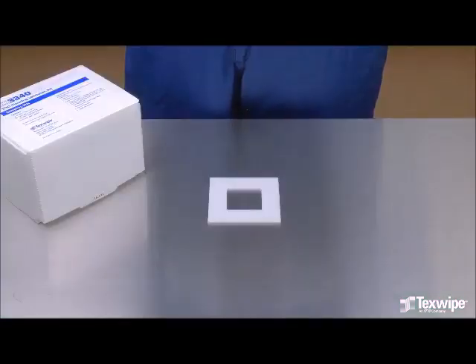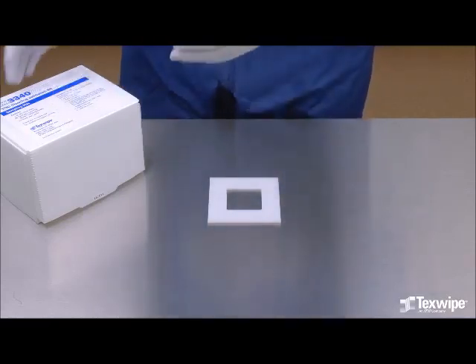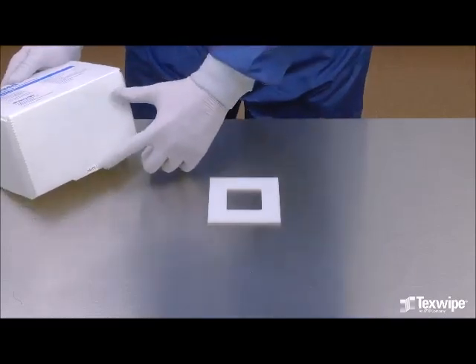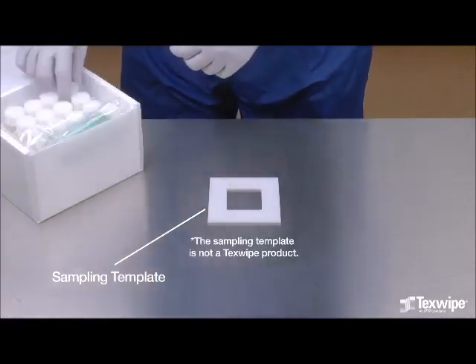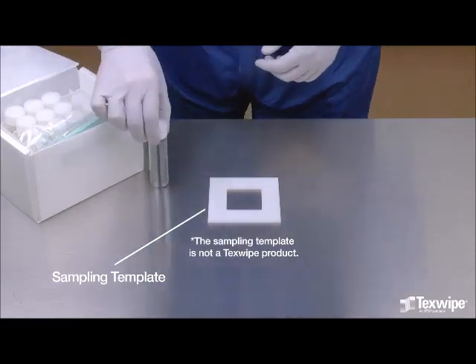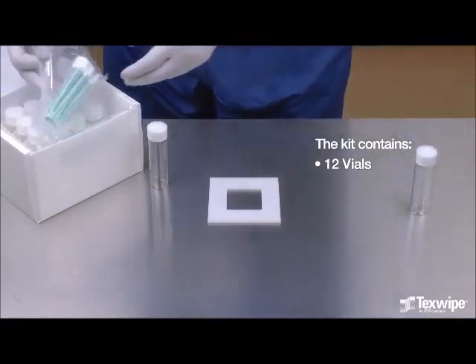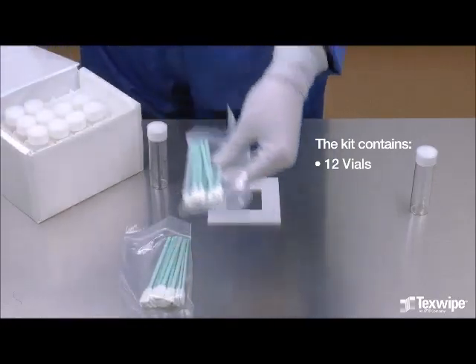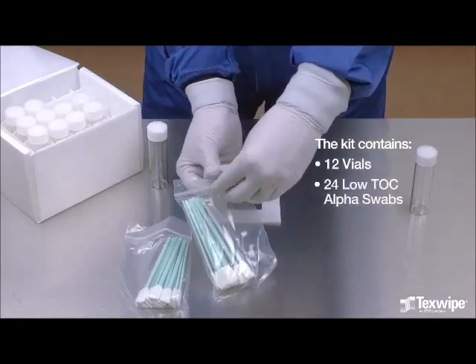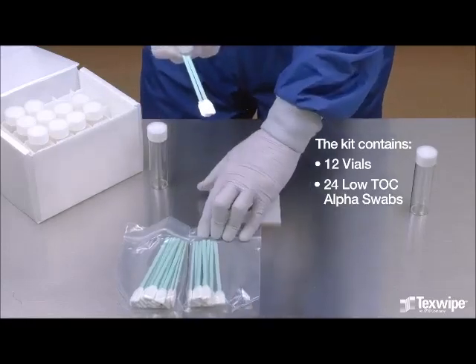Step 2: Prepare for Sampling. The TX3340 TOC Cleaning Validation Kit will be used for demonstration. Each box is individually lot coded. A sampling template is used to define the sampling area. Please note, the template is not a part of the kit. The kit contains 12 vials. The first vial will be used for the low TOC water to wet the sampling swabs. The second vial will be used to place the swabs in after sampling. The kit also contains 24 low TOC alpha swabs with a notch for easy breaking after sampling.